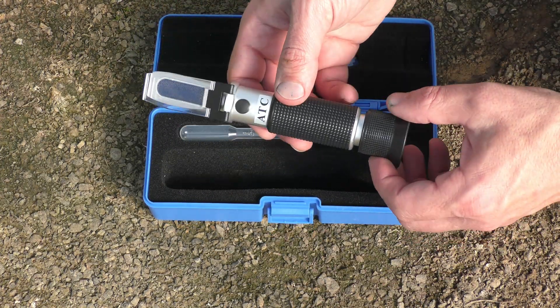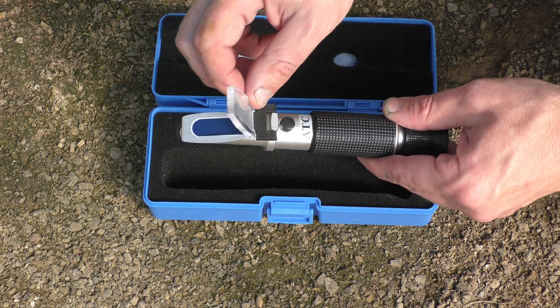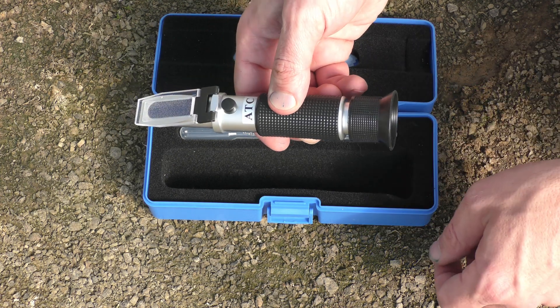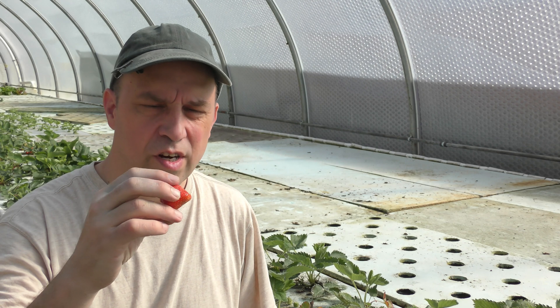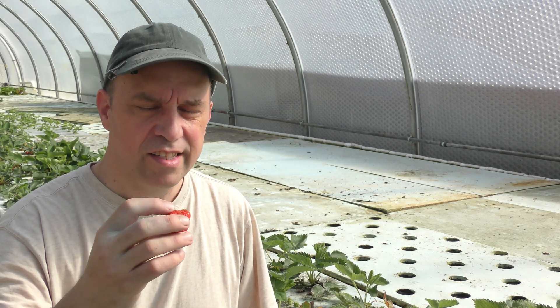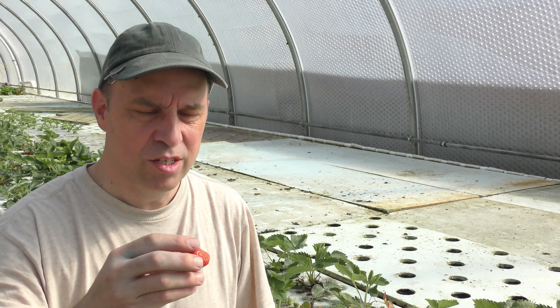The meter isn't complex at all. Basically, you put your sample right on here, look in this end, and it tells you what the sugar level is. First we'll try out the underripe one. I'm just going to take a taste out of each one first, just so I can do a little taste test with each one.